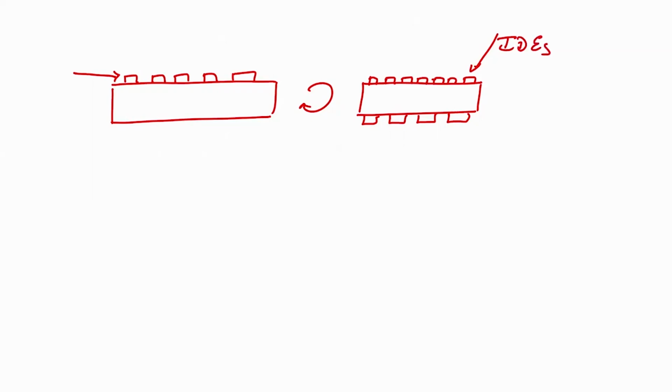On that you create a channel, the cross sectional view. So, how can you create the channel? You create a channel in a PMMA sheet like this.